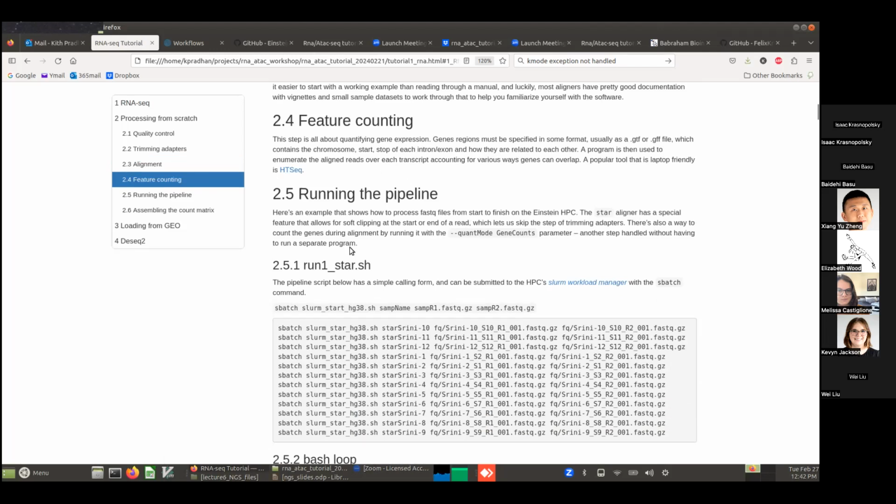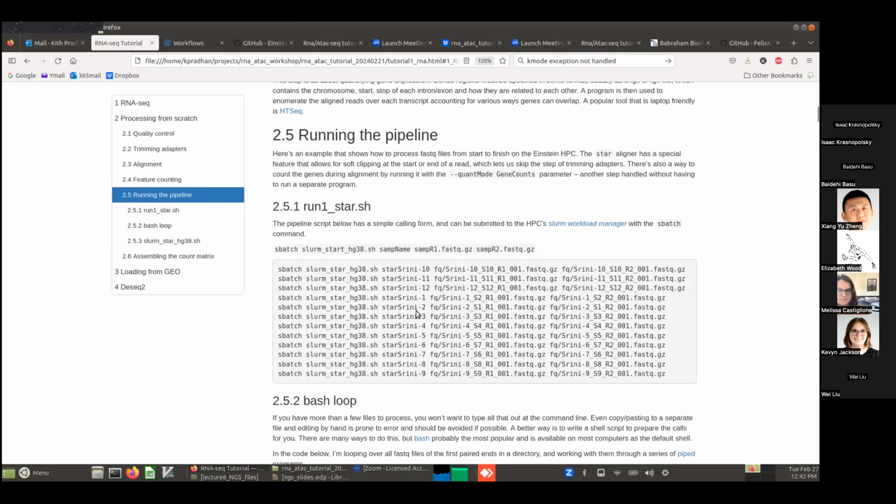The actual running procedures, this sort of pipeline, it's this procedure. I'm actually using Star for a lot of the pre-processing, because Star has certain built-in features that maybe are not well documented, but that just make the whole thing easier. One thing is that it allows for something called soft clipping. So if you have a fragment that maps to a section, say a fragment is 100 bases long, maybe the last 20 bases don't map, but the first 80 bases do.